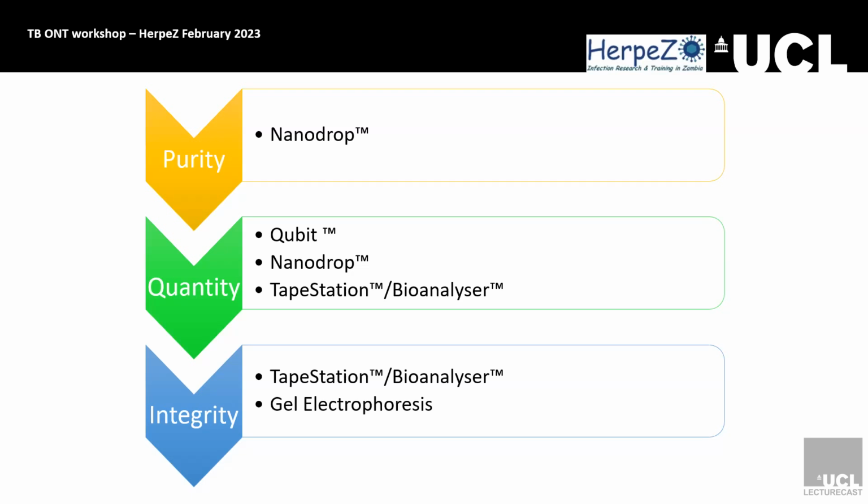And then this will tell you, for example, if you're doing a PCR and you want to know whether you're getting the 300 base pair fragments. If you run a TapeStation, you can see that the fragments you're getting are around 400, and it will tell you whatever other fragments you've got in there as well. On a gel, you can typically see it's around that 300, because you have to run a ladder. Within 2 to 4 base pairs, you can get resolution up to that amount.